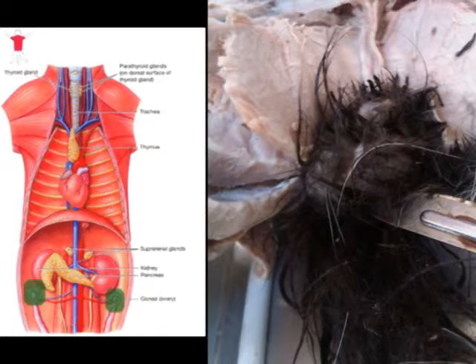Our cat is male, therefore has testes, which are found at the scrotum between the legs. It produces testosterone, which helps develop the reproductive organs and masculine features.